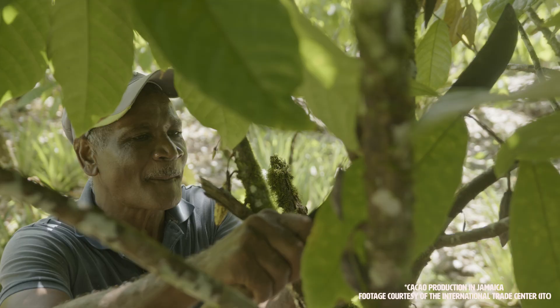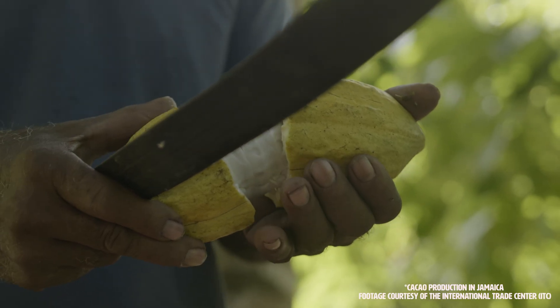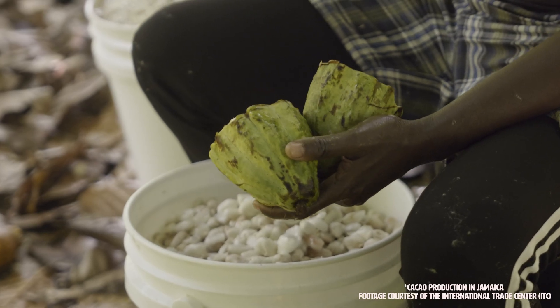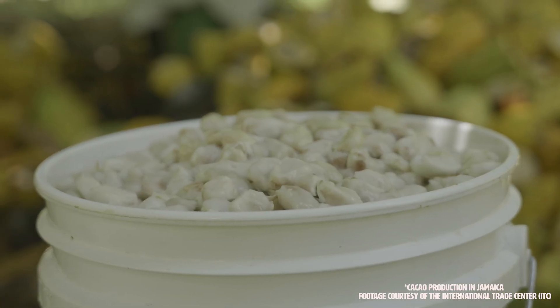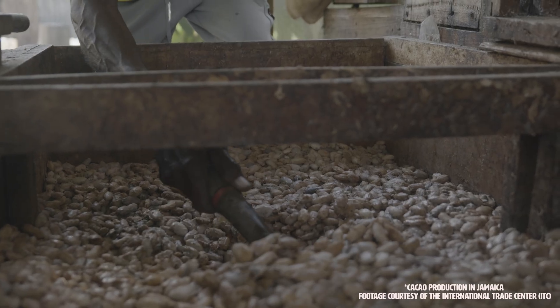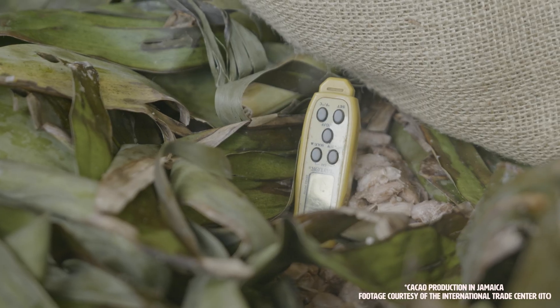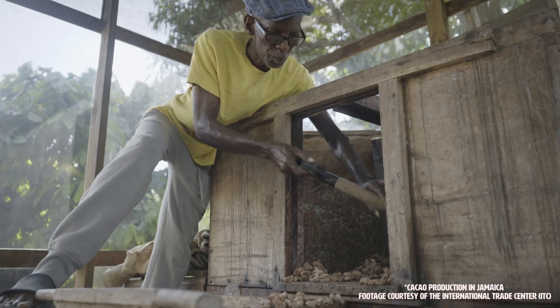This process can be conducted in the field or a laboratory setting, with or without access to electricity, and by an individual assessor or a panel of assessors. It offers a quick and cost-effective tool for monitoring the quality and flavor potential of a small, uniform cacao bean sample at the early stages of the value chain, following harvest and post-harvest processes.